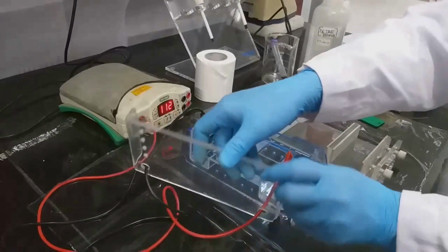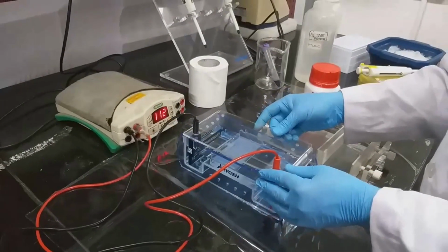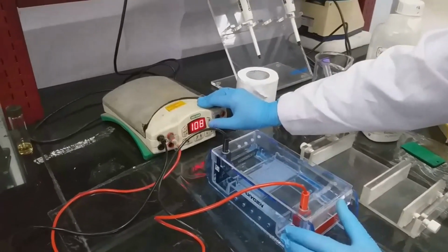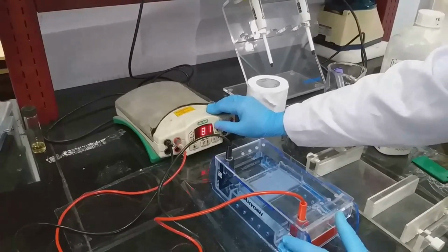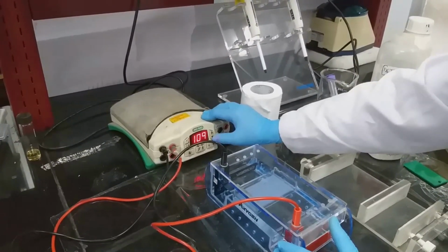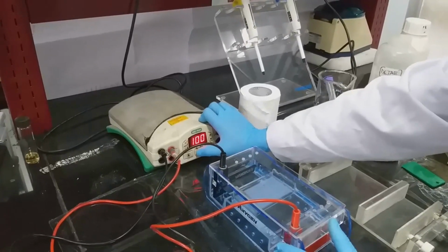The loading is over. We have to cover the electrophoretic apparatus with the lid, and we have to adjust the voltage. Then start the run.